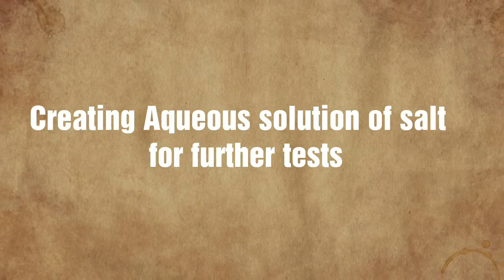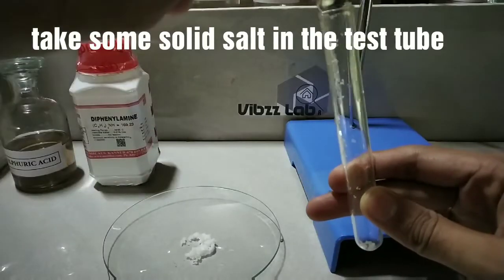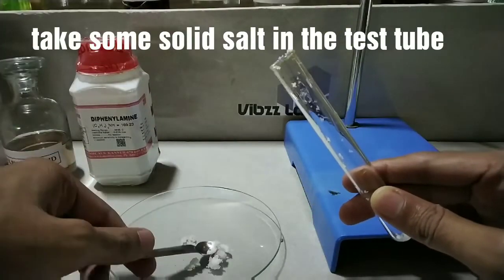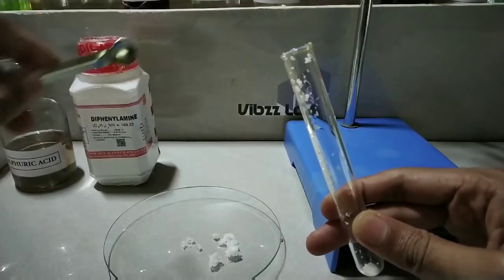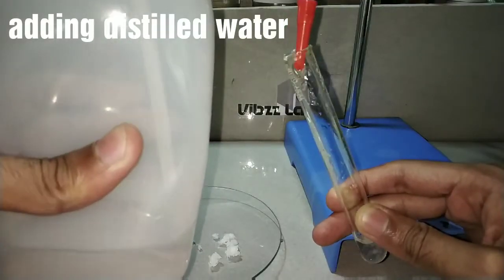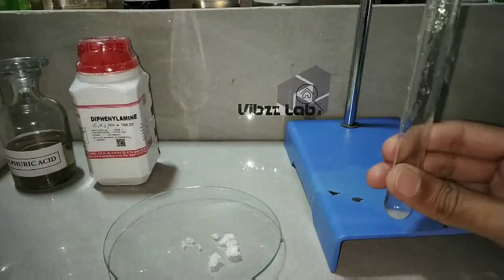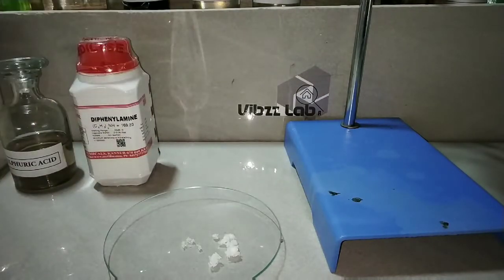Before the other tests, let's create the aqueous solution. Step 1: take some solid salt in a test tube. Now we add distilled water to dissolve the salt. Here we have the aqueous solution ready.